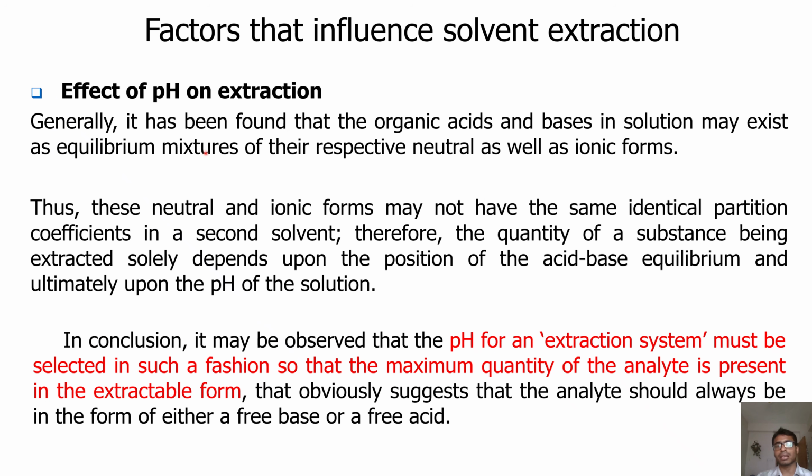So temperature should be constant throughout the process. Then effect of pH on extraction. Generally, it has been found that the organic acids and bases in solution may exist as an equilibrium mixture of their respective neutral as well as ionic forms. Thus, these neutral and ionic forms may not have the same identical partition coefficient in a second solvent.